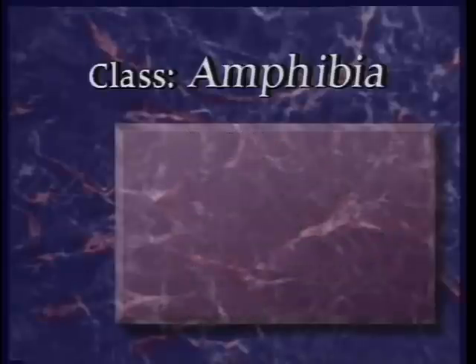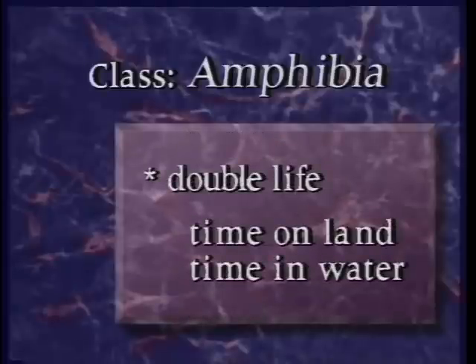The word amphibia implies a double life. For most species, this means spending some time on land and returning to water to breed.